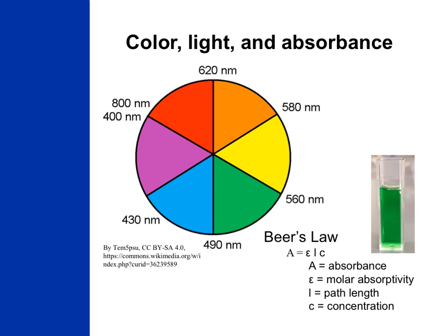In this experiment, we're going to be using our knowledge of color and oxidation states to determine which manganese species is the best oxidizing or reducing agent. Remember, the human eye perceives all mixtures of colors. When all colors are present, we see white light. When one is missing, we see its complement. That is the one that's located across from it on a color wheel. So when red wavelength photons are absorbed, we see the color green, its complement. Or when yellow photons are removed, we would see purple.